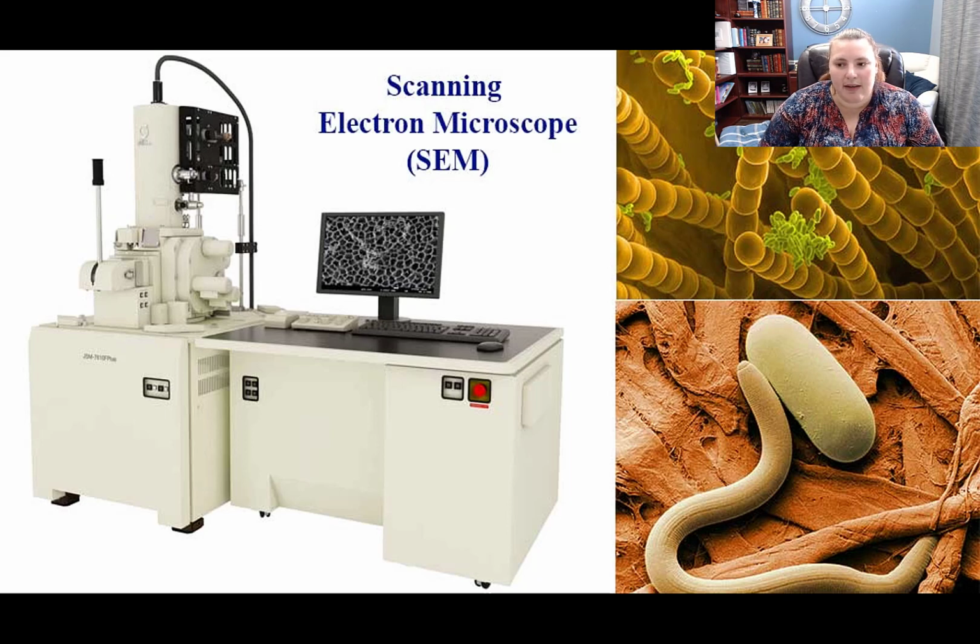The way SEM works is by sweeping electrons over the surface and then measuring signals produced on a detector. The signals measured include the secondary electrons, the backscattered electrons, and the characteristic X-rays, all of which are described in your text. As you can see from the images here, SEM develops some of the most detailed, precise images of microscopic particles and objects to date.